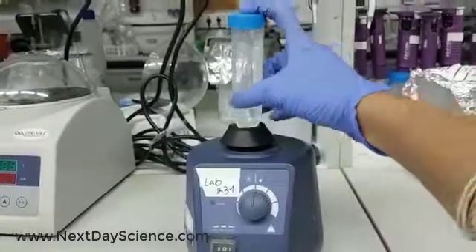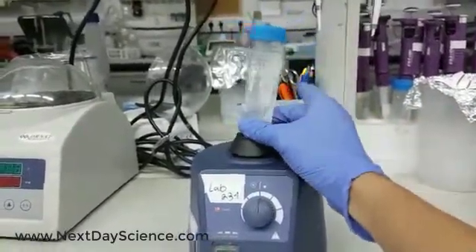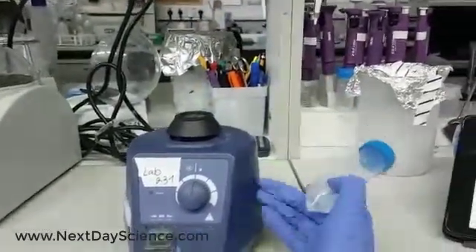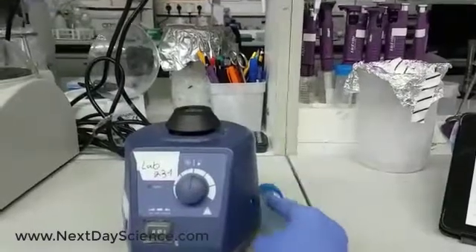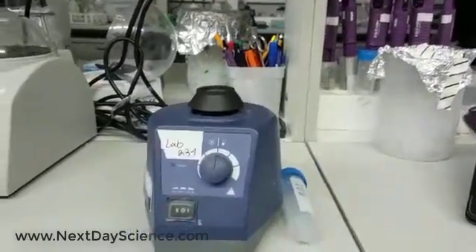So you can choose between a massive or gentle mix. Thanks to that, we can choose the best mix for our samples. Please visit the Next Day Science website for more information. Thank you.